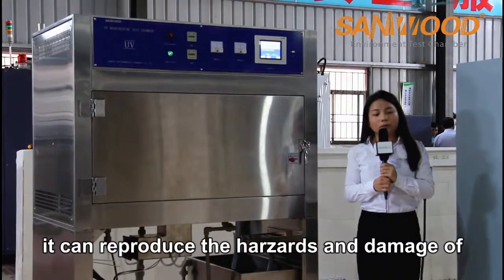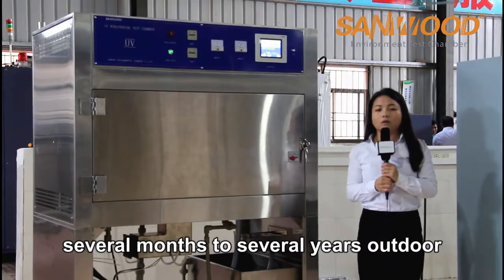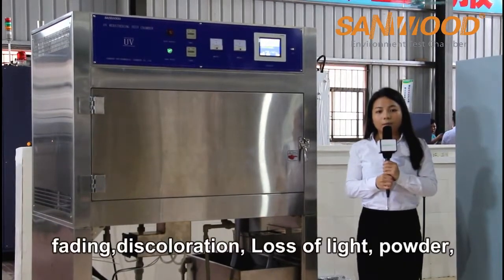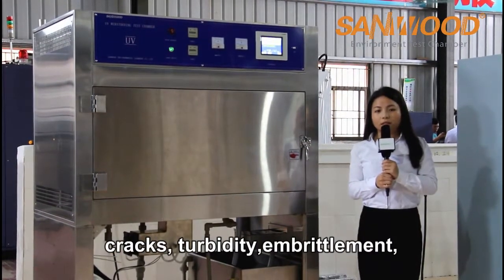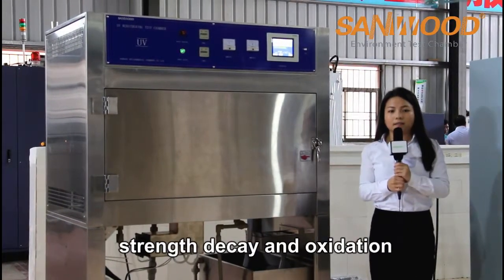It can reproduce the hazards and damage of several months to several years outdoors, including product forming, fading, discoloration, loss of light, powder, cracks, turbidity, embrittlement, strength decay, and oxidation.